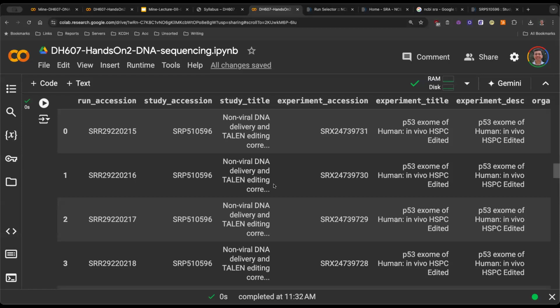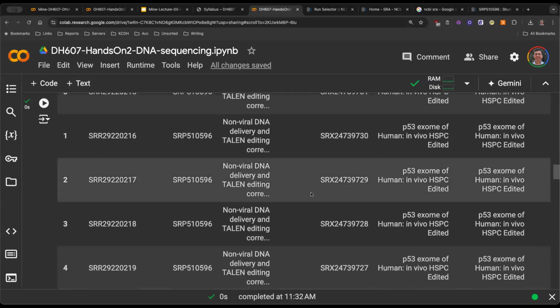There are experiments on SRA which have 1,000+ different samples. Just imagine going through that painful route of fetching that data, waiting for that loading sign to end, somehow downloading it, and then analyzing. This makes it much, much simpler. Everyone with me so far?